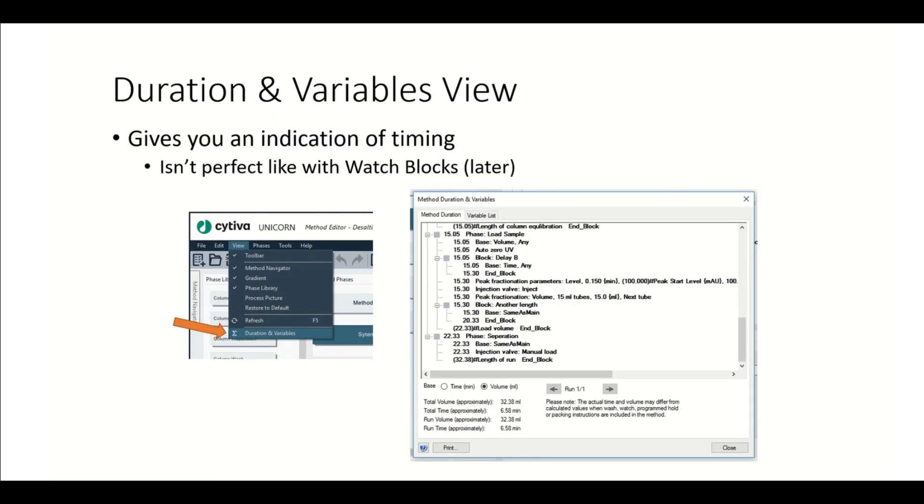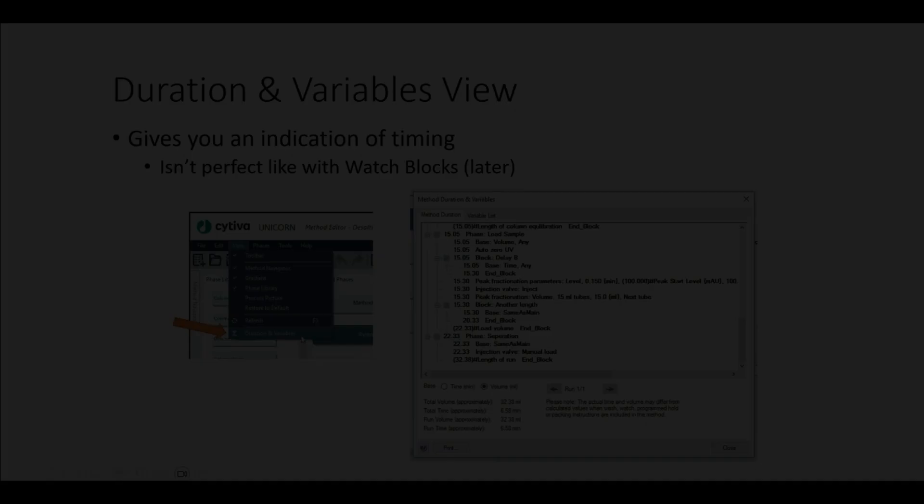I think the authors of the unicorn program have recognized that this is basically a problem and they've given us a way to be able to look at that timing, though it isn't perfect. So that imperfection is described right here in this box. In order to see the duration and variables view, we're just going to go to view and then duration and variables. Let's do that in unicorn really fast.